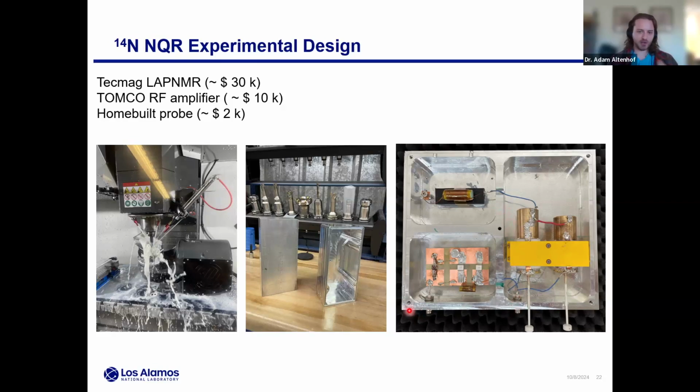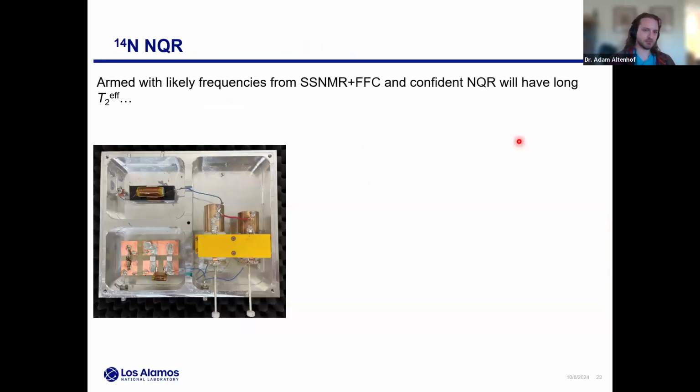And you can mill in whatever RF adapters you want. And just to know, everyone doesn't have a 5-axis CNC machine, but we did ask a machine shop, how much would it cost you to make this and sell us the aluminum box? And it's just about $2,000. So still a really simple, affordable solution here.